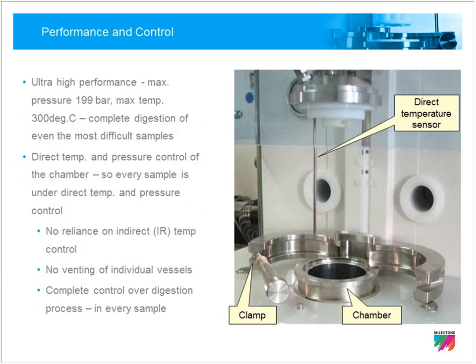Just a close-up picture of the actual reactor itself. Again, it's a 1-liter stainless steel reactor with a stainless steel cover. There is both a Teflon cap and a Teflon liner that fits inside, and here you have direct temperature measurement. Now, the temperature and pressure capabilities of the UltraWave are 200 bar and 300 degrees C.